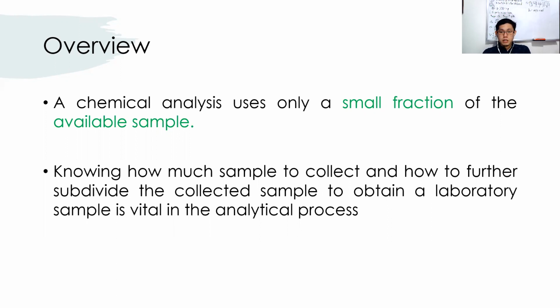And then other chemical aspects such as nitrate content, phosphates content, heavy metals, and then biochemical oxygen demand. So dapat alam mo, bago ka mag-collect, kung gaano karami yung i-collect mong sample para doon sa mga specific analysis na to and kung paano mo sila i-divide.